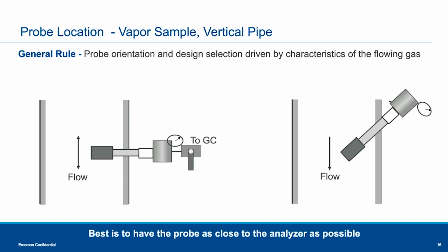This one you do need to understand what your composition is, and what your directional flow is. You can do a 45-degree angle if the flow is up, but in this case I have a squared probe, so it is only recommended for flow that's down. If you were to have flow up, it is preferable that you have a slant or cut into the probe surface to help avoid contamination.